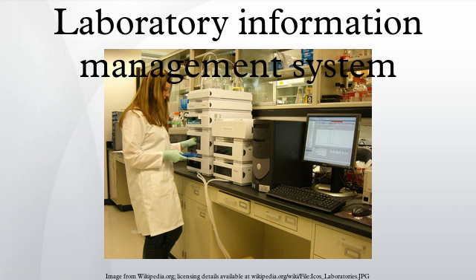The primary advantage of a web-enabled LIMS is the end user can access data both on the client side and the server side of the configuration. As in a thick client architecture, updates in the software must be propagated to every client machine. However, the added disadvantages of requiring always-on access to the host server and the need for cross-platform functionality mean that additional overhead costs may arise.